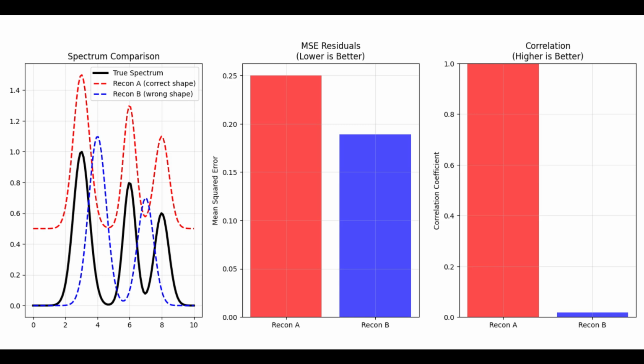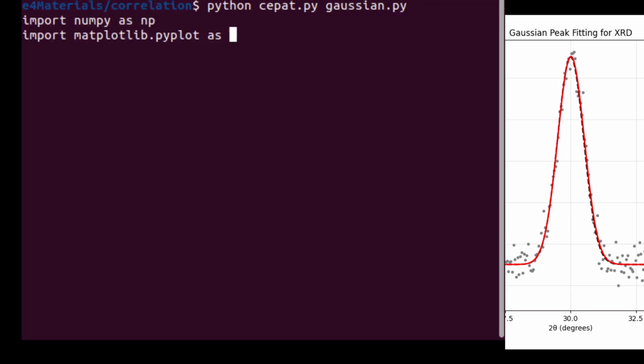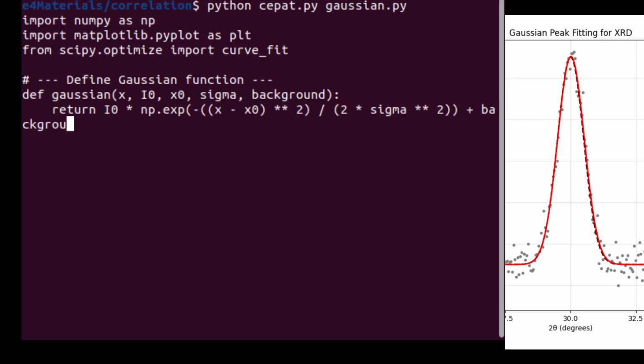Suppose we have 3 candidate spectra and 1 reference. Correlation helps us quickly identify which candidate matches the reference best. This is why correlation is widely used in Raman spectra and XRD pattern databases for that particular purpose.